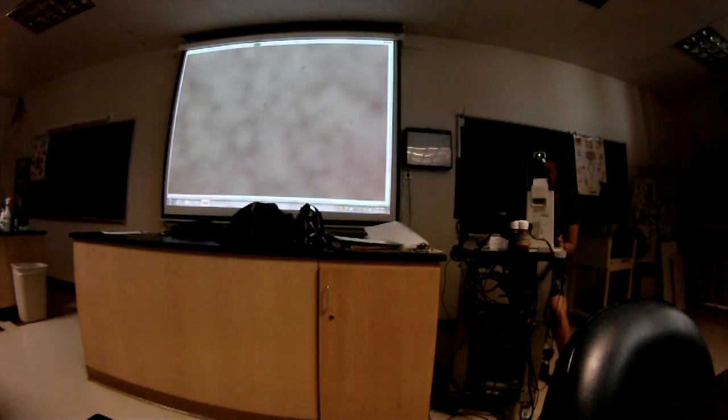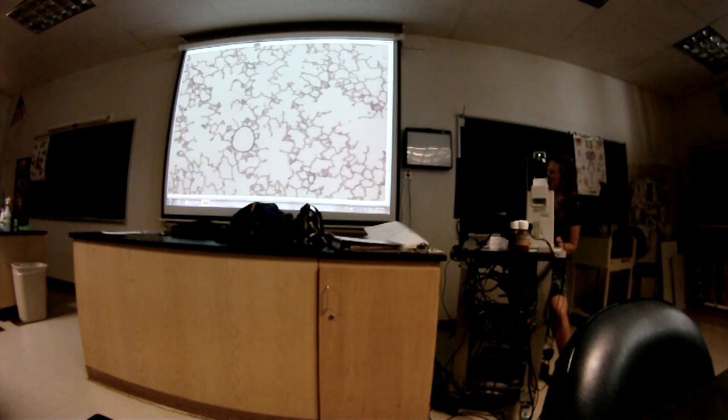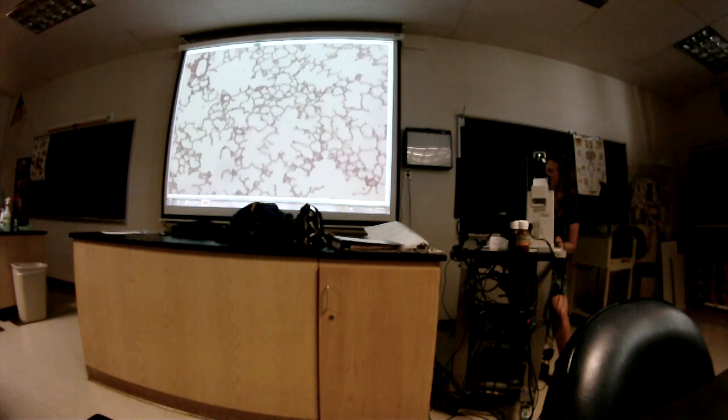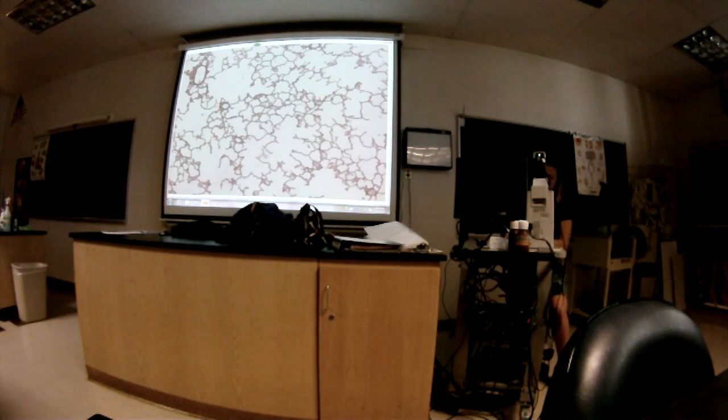Moving to a different slide. Okay, what organ is this?